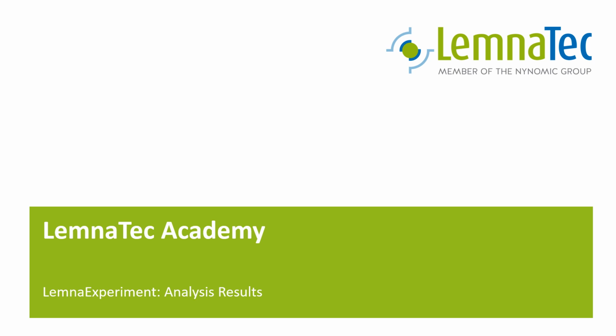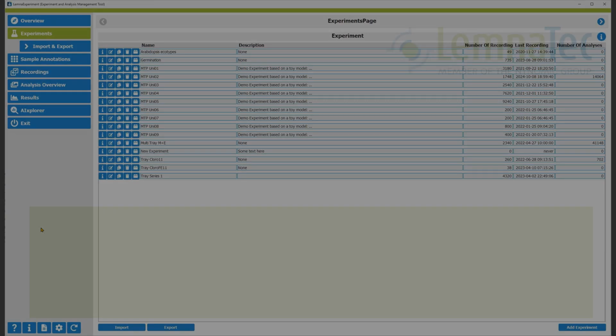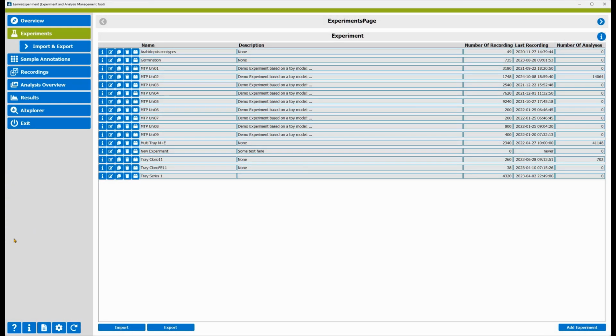In the last video, we submitted and executed our first analyses. Today, we look into the results of these analyses. You find the analysis results at two places. The numbers can be evaluated further in the results section. More on this in a second. The result images can be inspected on the recordings page.